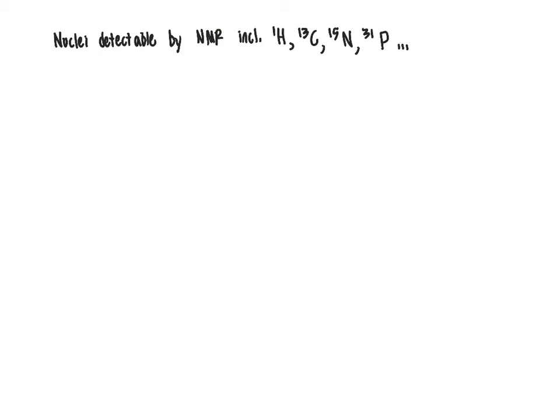And in this unit, as we continue onward next week with a variety of different types of NMR experiments and using that to deduce complete chemical structures, carbon-13 and protons are going to be the two main types of NMR that we will focus on in both one-dimensional and two-dimensional modes, which don't worry if you're scratching your head and going, what's 2D NMR right now? We will get into all of that in the upcoming videos.